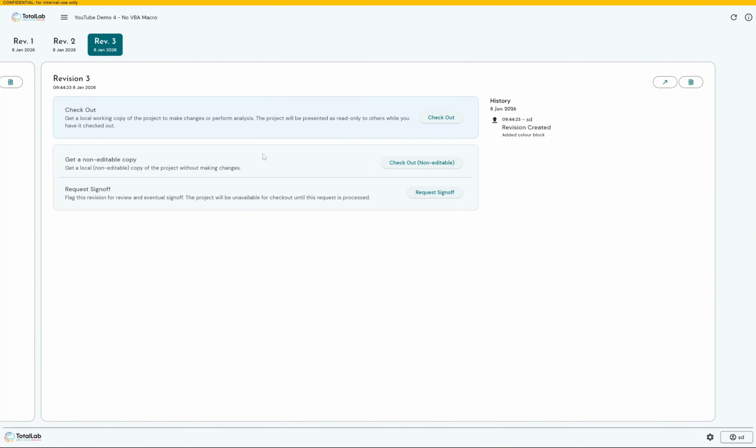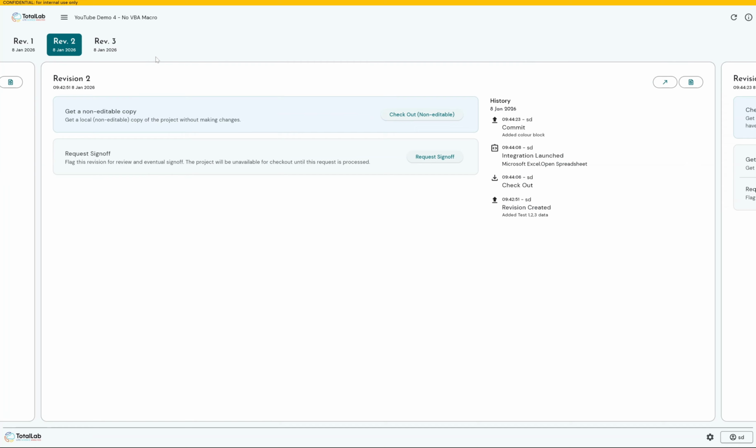There is an avenue for that, even if you use the settings that we've got in AuditSafe to enforce people to add notes. You can enforce them to add notes, but you can't enforce them to add correct notes, if that makes sense. So again, if I want to go back and see how something's changed over time, I know who accessed it because I've got the full audit trail.